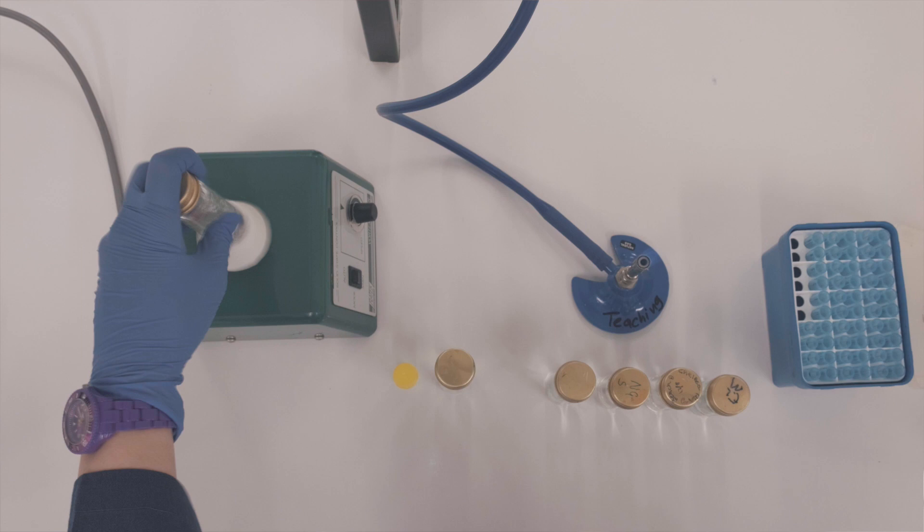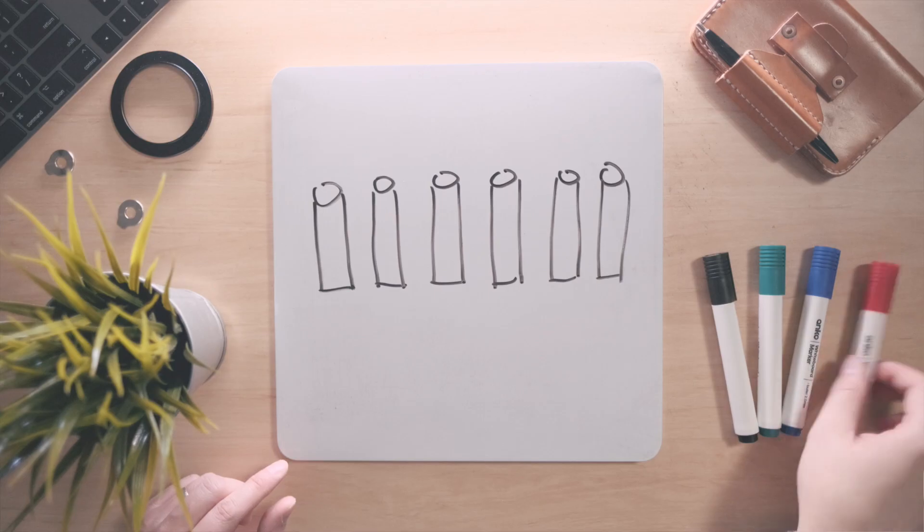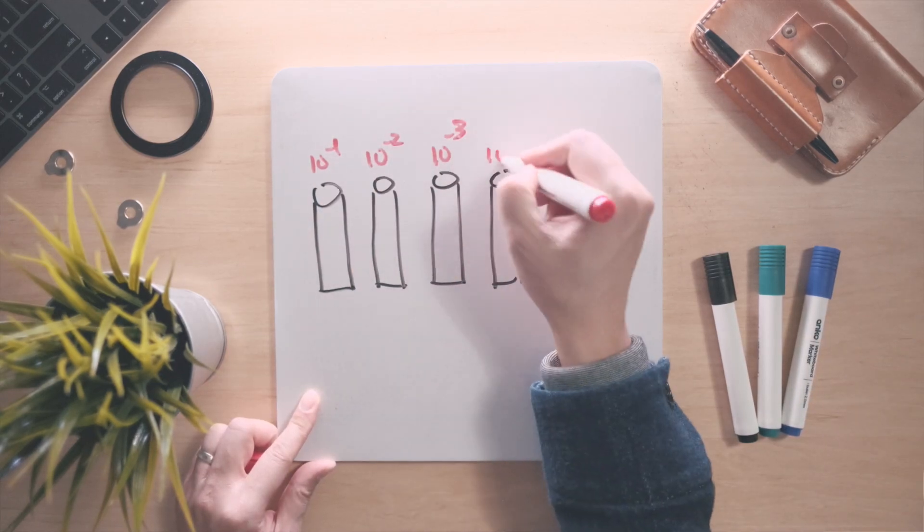Again, we homogenize by vortexing, and this is the second 1 in 10 dilution. This process is repeated across all 6 bottles.